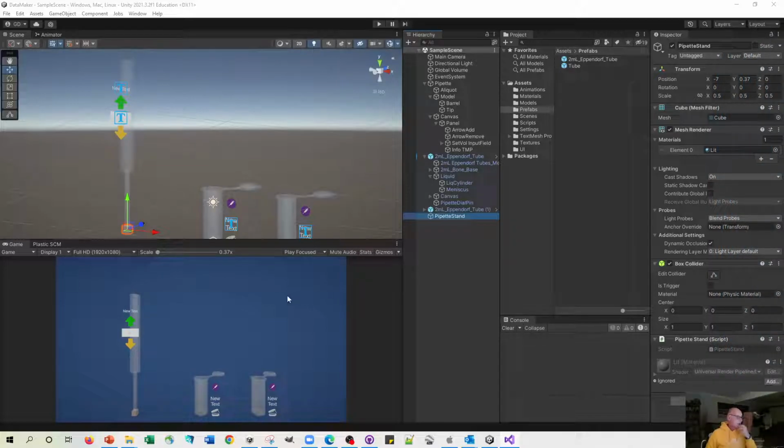And as I said, the really exciting thing about this is that we now have not just this visual appearance of liquid in the pipette, we also have something that's really flexible. It's going to allow dispensing set volumes of a master mix, for example, 50 times over without having to go and refill. So I think that's going to be a major advance.